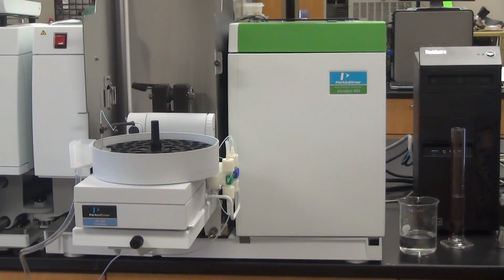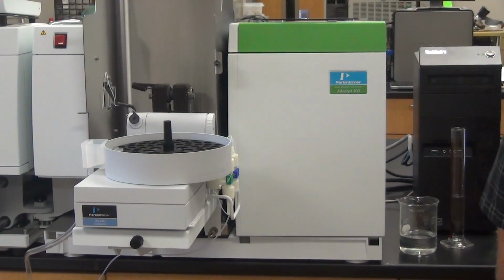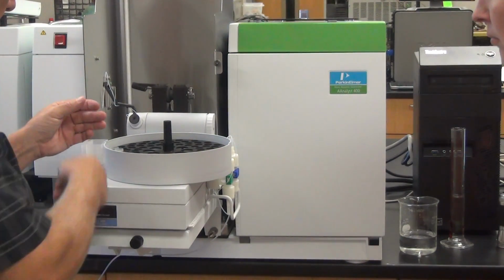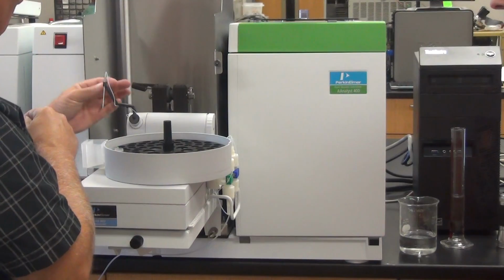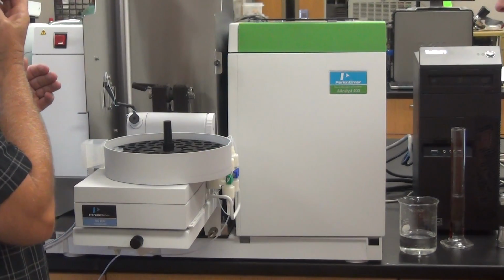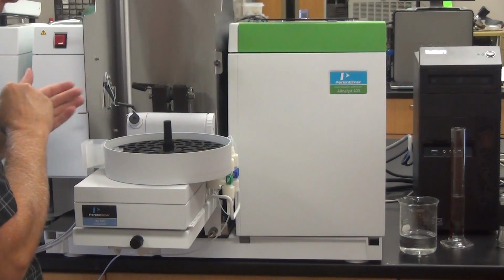And then there's a position because this one had a little knob that you, okay? This one doesn't. You would tell it to line the tip and it would turn it off so that you remove it. Well, this one you go line tip and it says suspend it above the rinse vessel so I can cut off the tip. So I would get a pair of pliers and pull this bottom out from here after it got smashed or something. And you take a really brand new single edge razor blade and you get something plastic.